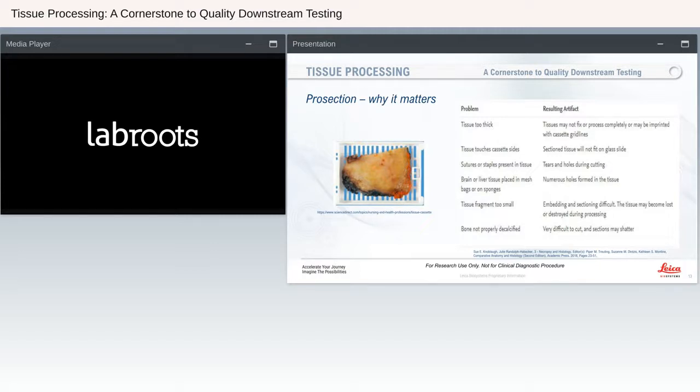Also too, if the section is too large, it may not fit on the glass slide when you cut your sections. So there's other items here too that you can run into when the section is not thinner than a nickel or the size of a postage stamp, or even not even placed in the correct cassette. So at this point, we are ready to begin our tissue processing.